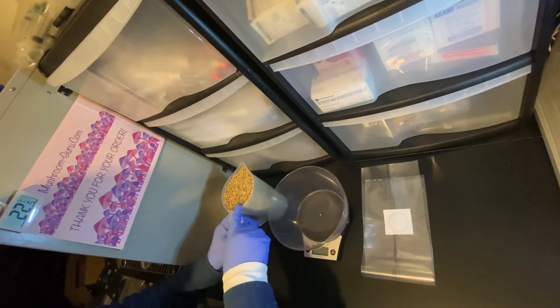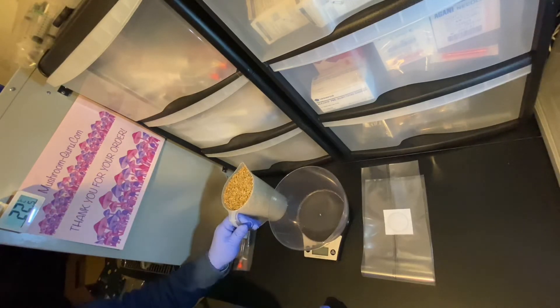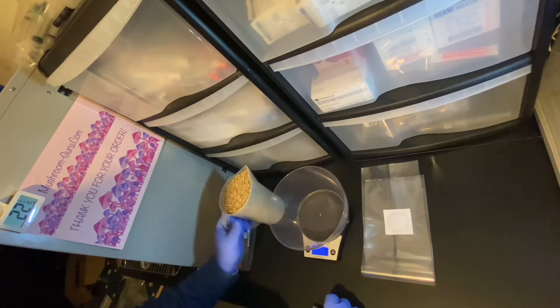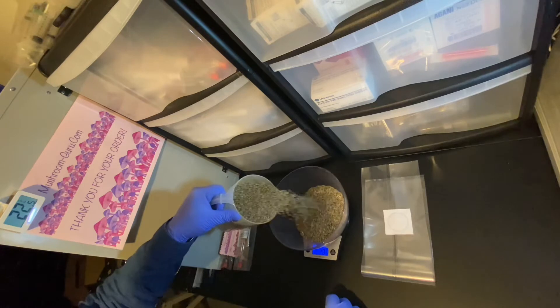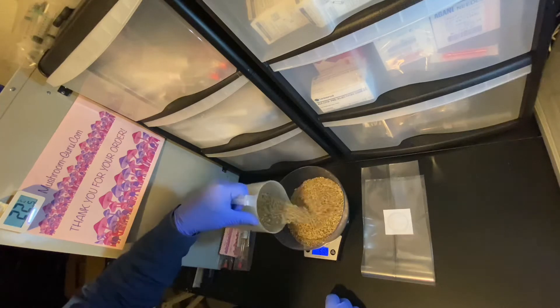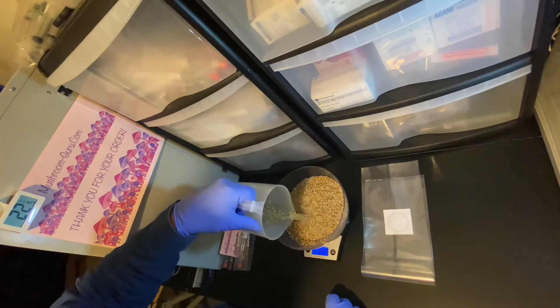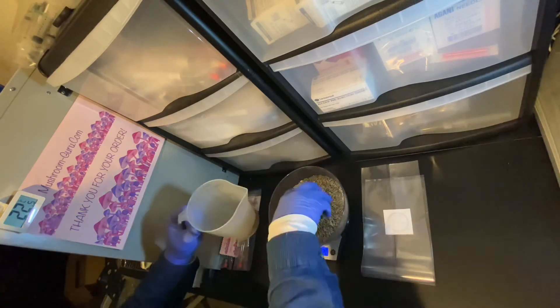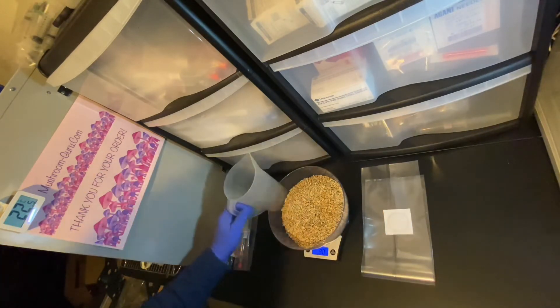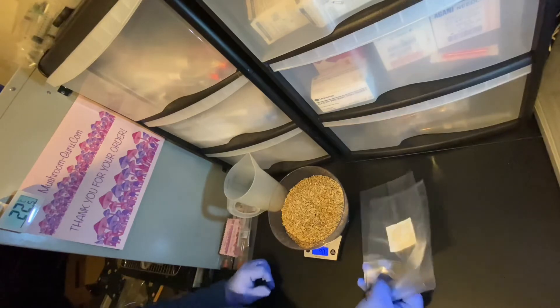All we do is weigh out 900 grams of rye grain, which is brilliant — every mushroom loves rye for some reason, they really like to grow on it. We measure out 900 grams of rye grain. 901 — doesn't matter, one gram more or less.